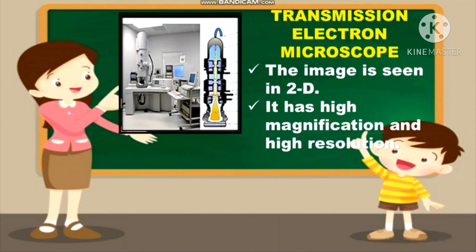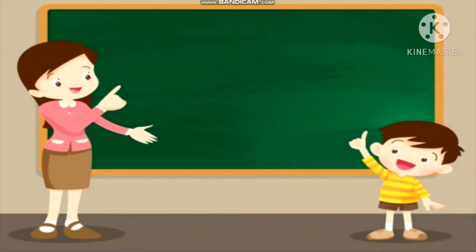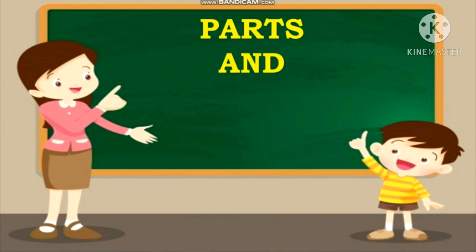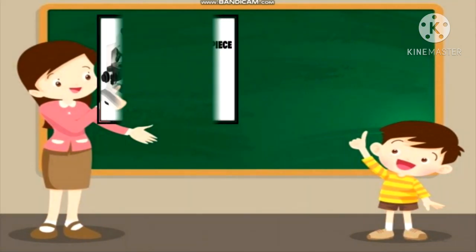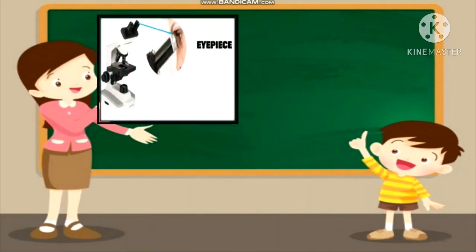Well then, now we proceed to the different parts and functions of microscope. So we have here eyepiece.